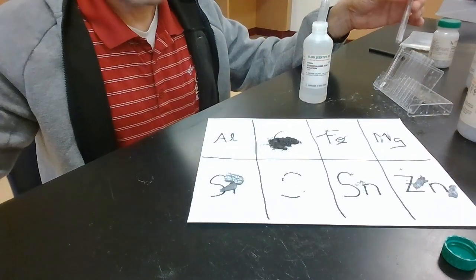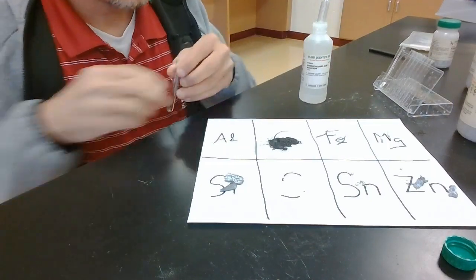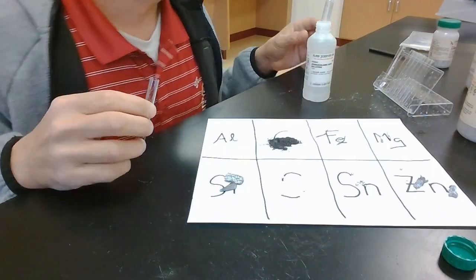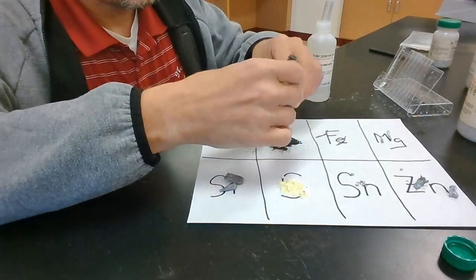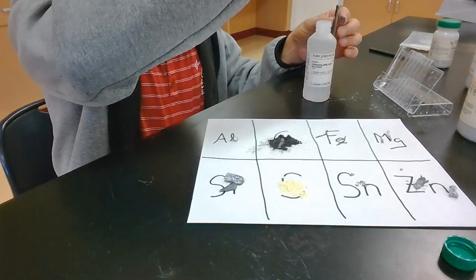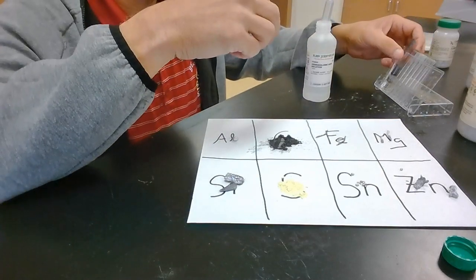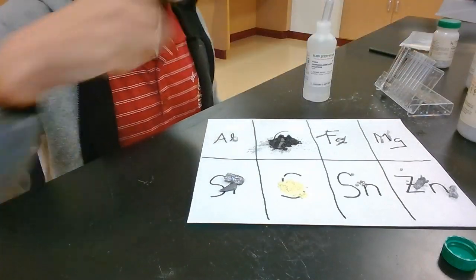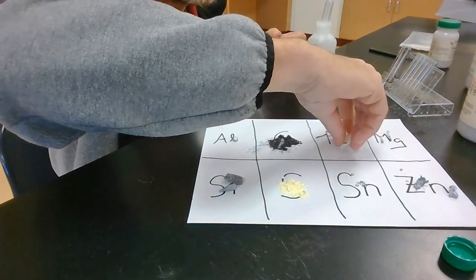Okay. The next one here we got is some copper. I'm sorry, some carbon. There's carbon in here. Add some hydrochloric acid. And we'll leave that sit, see if anything happens. I'm going to take a piece of iron.